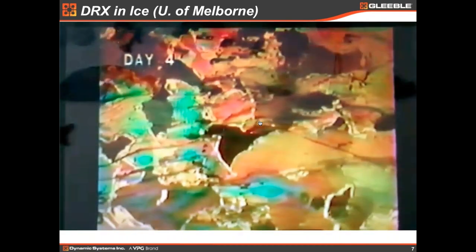So we have this video, it's well accelerated. The total length of the video was 4 days. And we have more, actually, continued, just a piece of that, so that you can see that dynamic recrystallization happens.